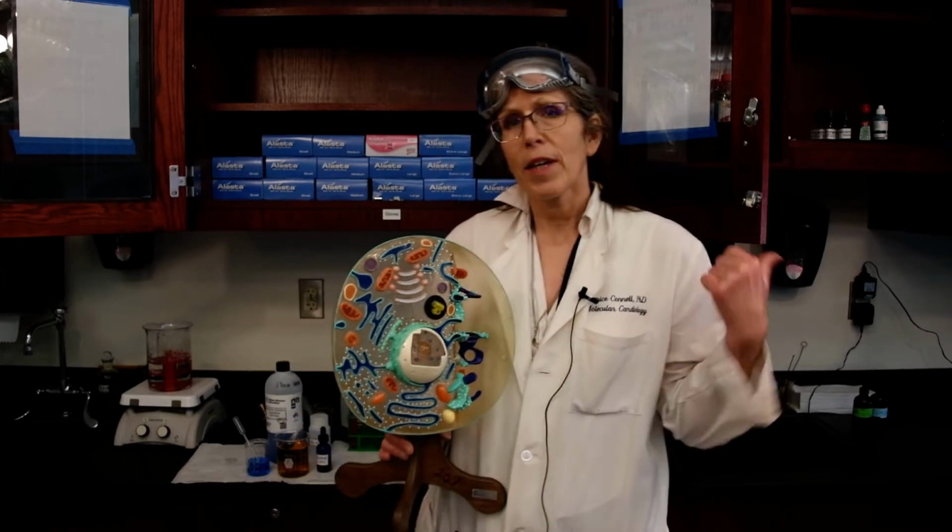So the experiments we're going to conduct are experiments that are assessing molecular movement. We've been learning a lot about the cell and about the plasma membrane of a typical cell. Now this is just our model, right? Real cells look quite a bit different, but again, we're just trying to use this so you guys can start to relate to organelles, relate to the function, and relate to what cells do since they're the unit of life.